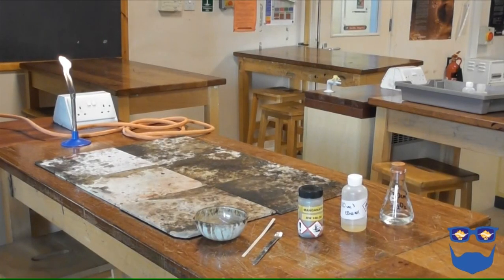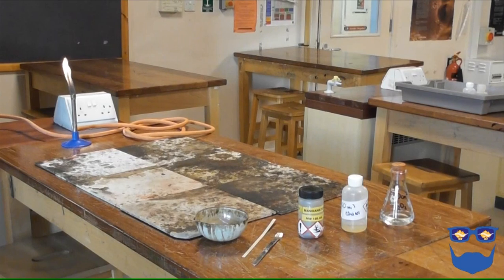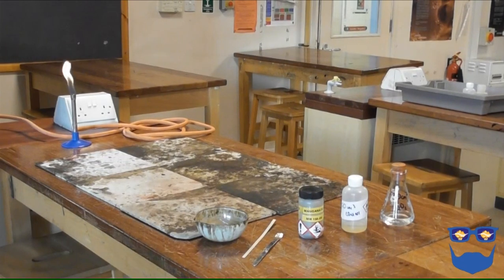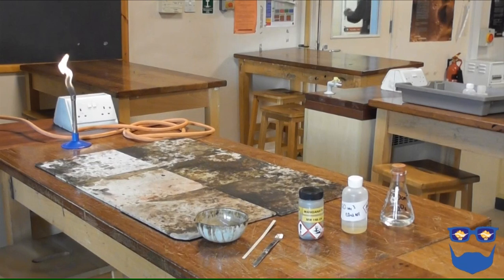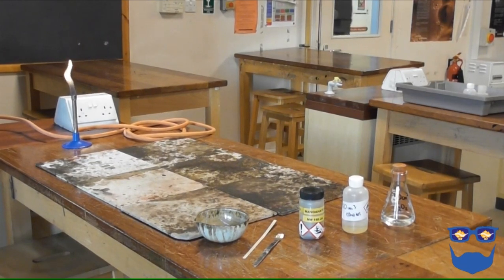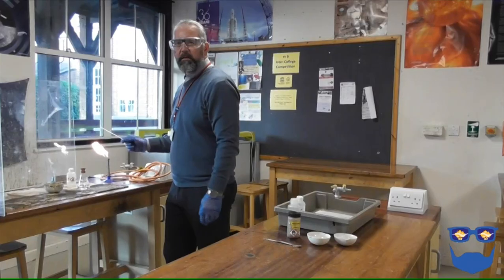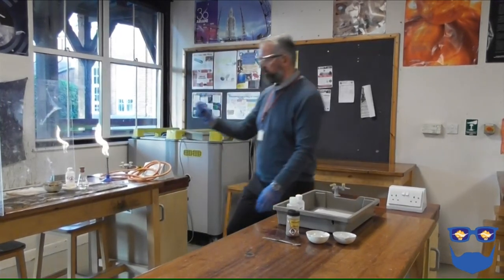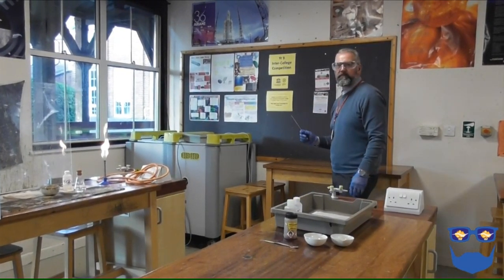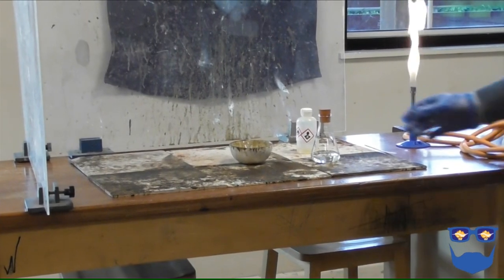Clear a work area. Put your heatproof mats down to protect the desk. Ask the students to move back — I try to have an empty desk between them and the demo. Put up your safety screens to protect you and them. Place your evaporating basin in the centre of the mats. Check your exit away from the experiment; I always walk it to ensure there are no obstacles.